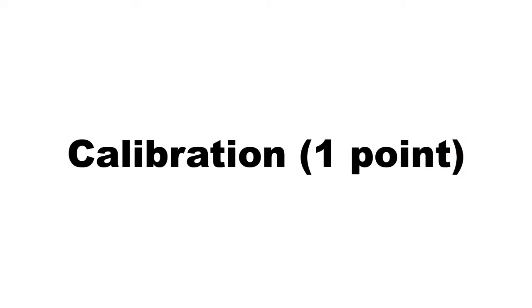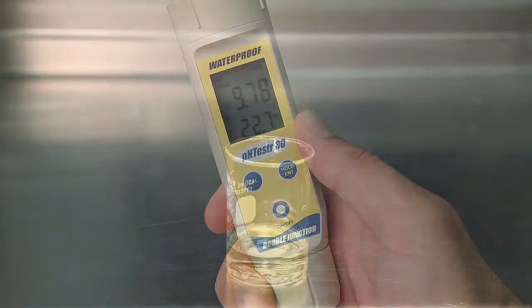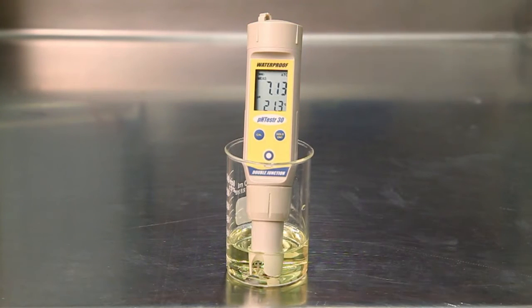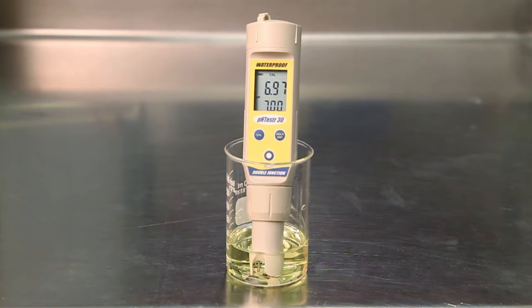pH calibration. Press the on-off button to turn on the meter. Place the electrode approximately 2 to 3 centimeters into the pH buffer 7 standard solution. Press the cal button to enter calibration mode. The cal indicator will be shown. The upper display will show the measured reading based on the last calibration, while the lower display will indicate the current pH buffer standard.